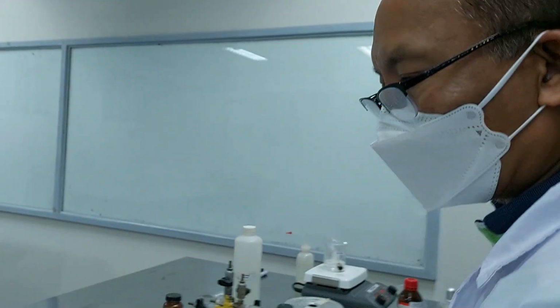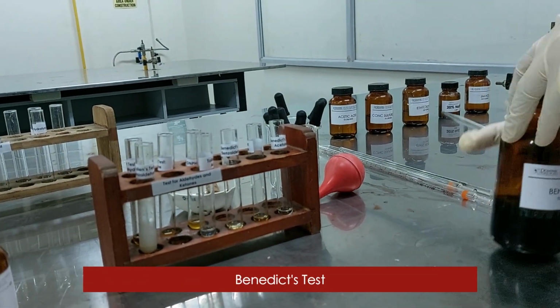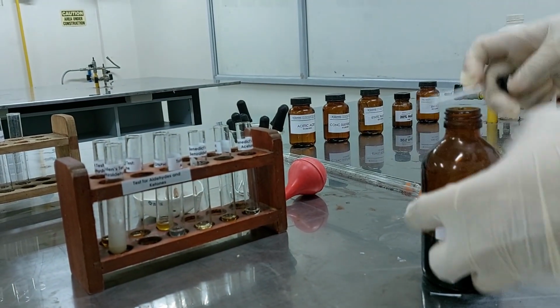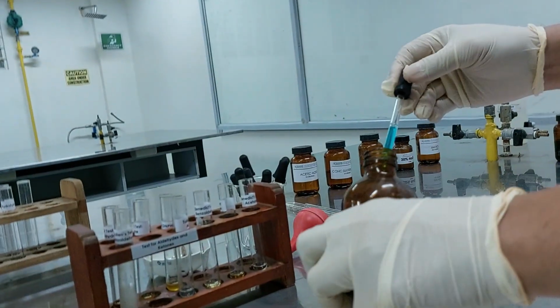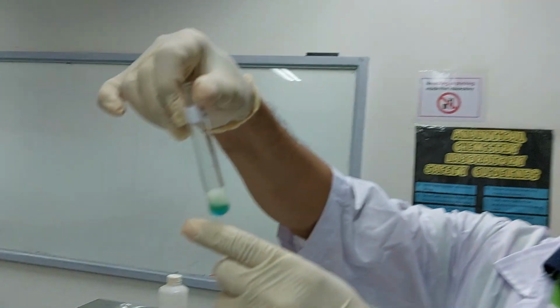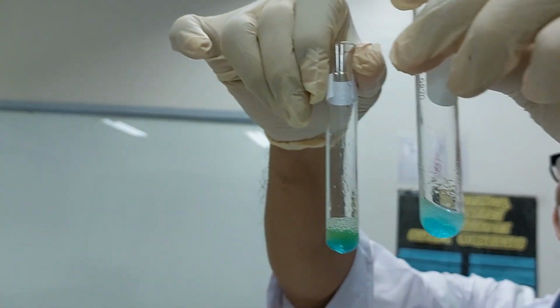Now we move on to Benedict's reagent, class. We're using benzaldehyde, acetaldehyde, and acetone again. We're expecting a brick red color. You notice there is a reaction already for this one, acetaldehyde. You already have a small amount of red.